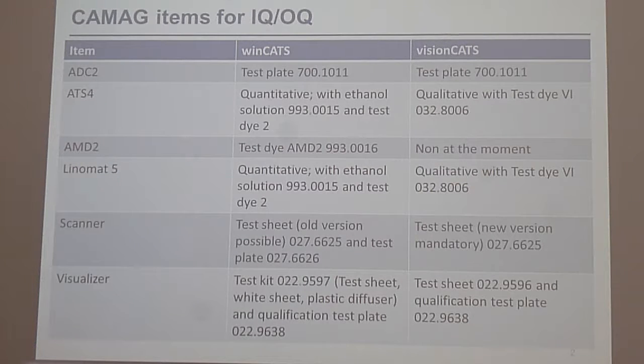They had the idea to have different concentrations here, and also some smaller spots. But I think the problem is that the paper fades away, and if the background gets a little yellowish, this spot changes differently from that one. So making a picture of a chromatogram in really good quality is not that easy.